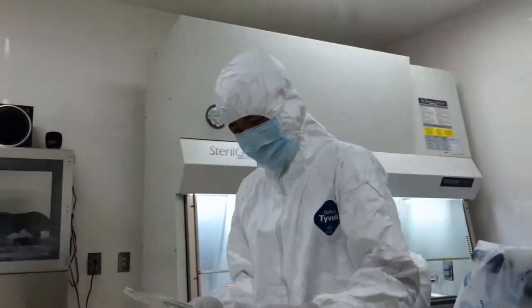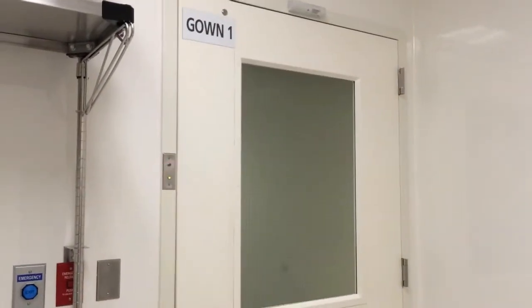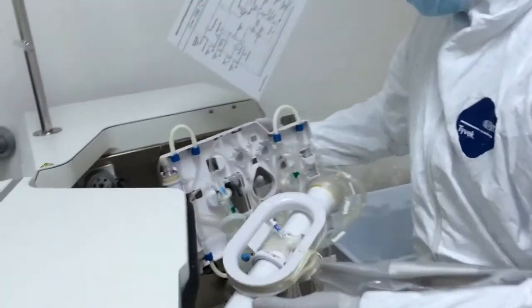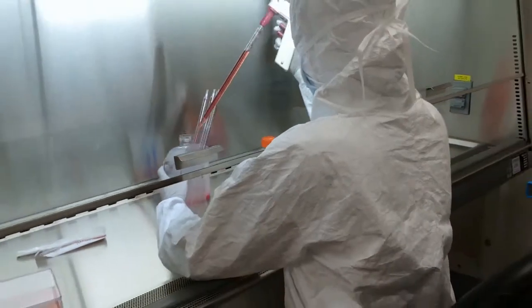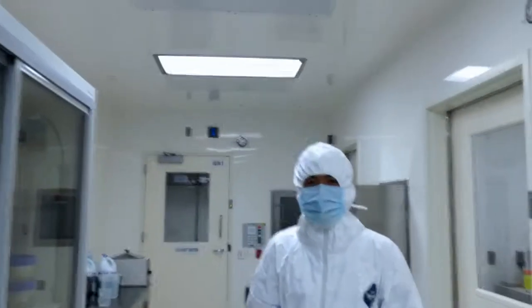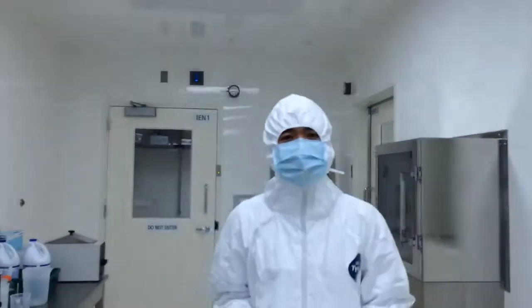This facility maintains sterility by specific room pressure monitoring, following of enter-exit protocol and daily cleaning. This lab also has state-of-the-art equipment including a high-power microscope and a hollow fiber bioreactor that produces more than 1 billion cells per run, compared to culturing flasks that produce 1 million. These GMP facilities are key to maintaining sterility when making pharmaceutical drugs and supplies.